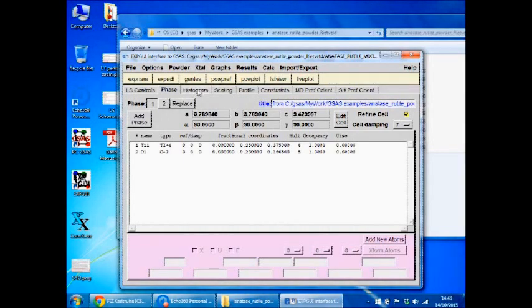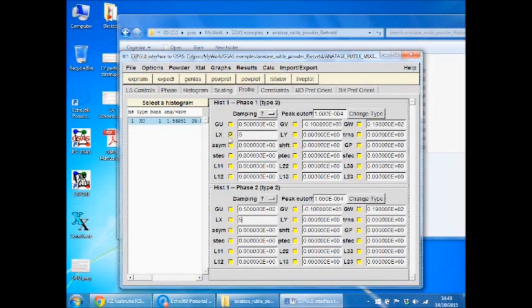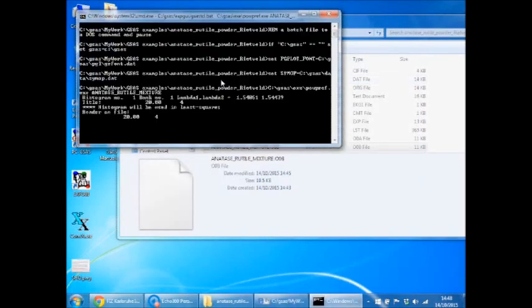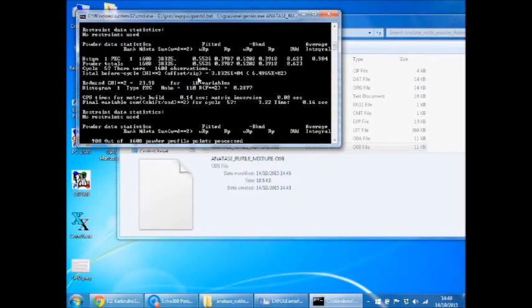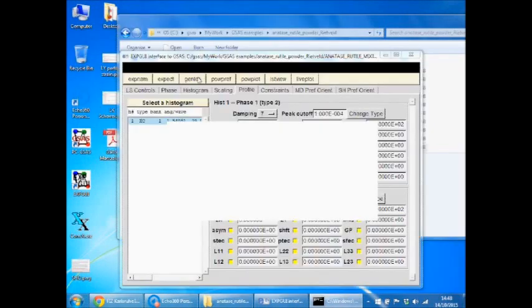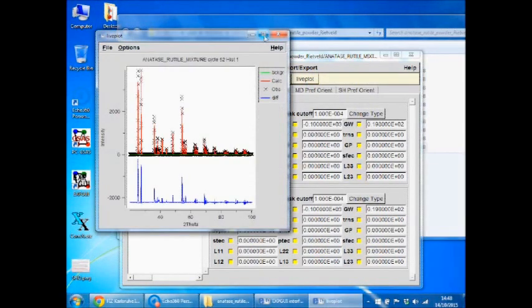So I'll just put some arbitrary numbers here and try and figure out what's going wrong. It's a good thing when things go wrong in the sense that you can then learn how to fix them as I'm here. Okay, that's working fine.